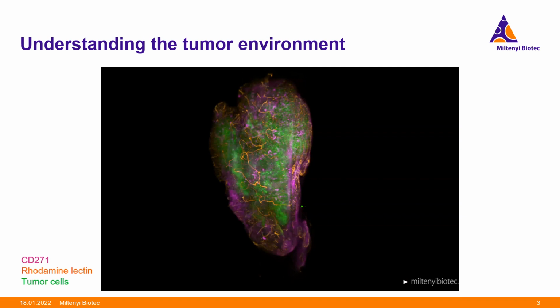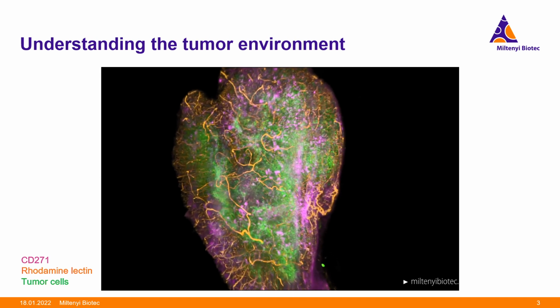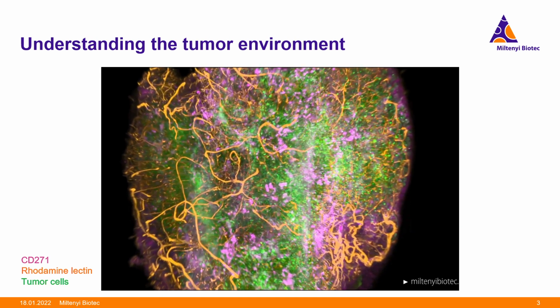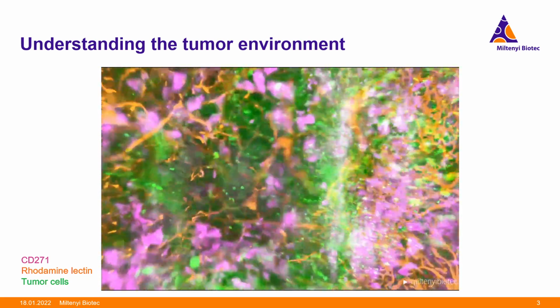3D fluorescent imaging is also fast becoming important in immuno-oncology and for assessing disease progression and drug efficacy. Drug discovery assays have seen the benefit of imaging spheroids in 3D to better understand, say, how a specific drug compound affects the spheroid, including drug penetration and interaction with its environment. In tumor biology, 3D imaging on an even larger scale, such as that of xenografts, can give insight into cell localization and even quantify tumor volume.